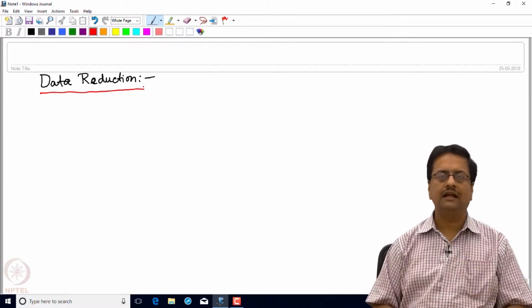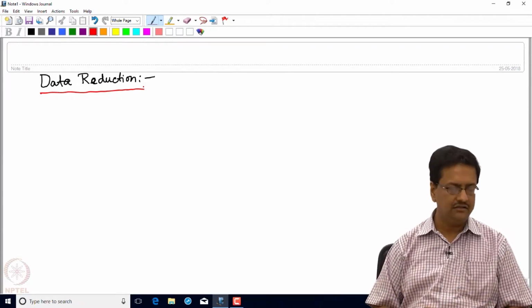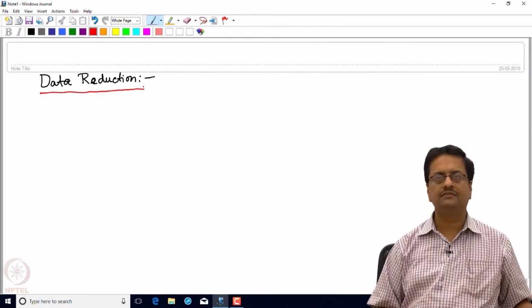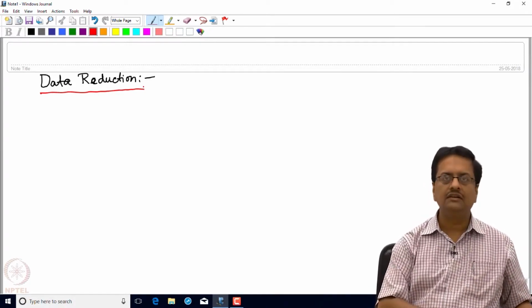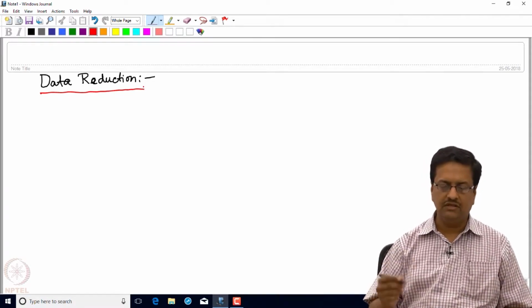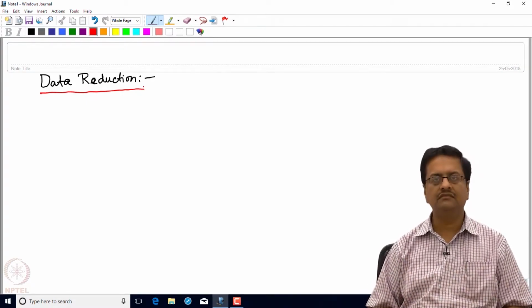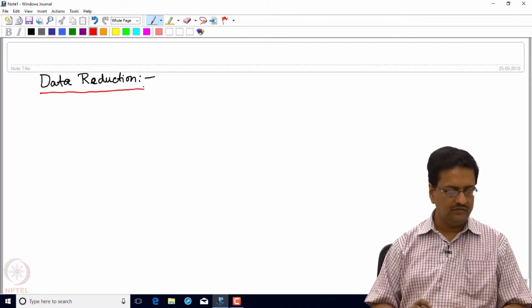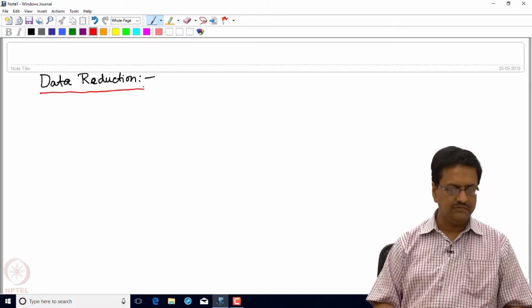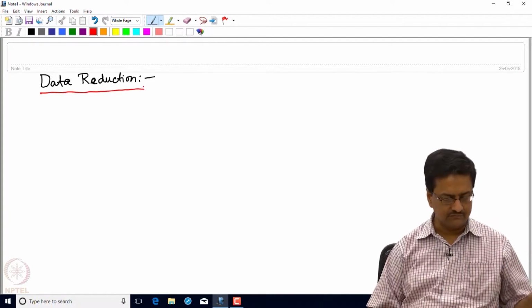So, whenever a diffracted beam meets the detector, it creates a signal there, and that signal is just the raw intensity, which has to be corrected for various factors. As you have already learned, we need to do a correction for the incident beam intensity. Depending on beam intensity, the diffracted beam intensity will vary. Then we learnt about the exposure time and its effect. Then we discussed the Lorentz and polarization corrections in the previous class.